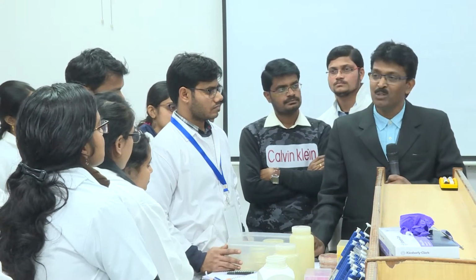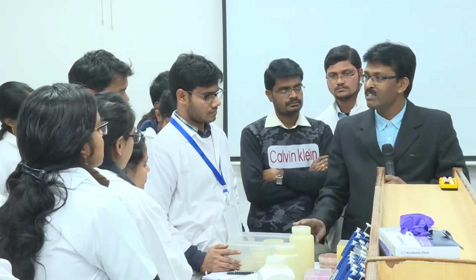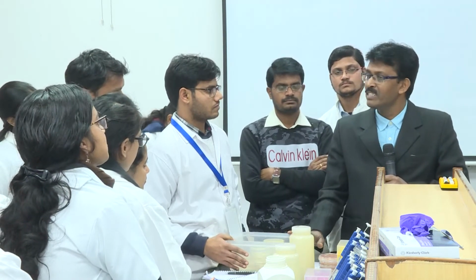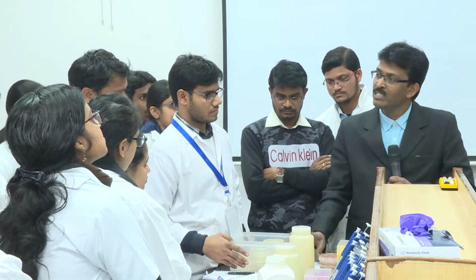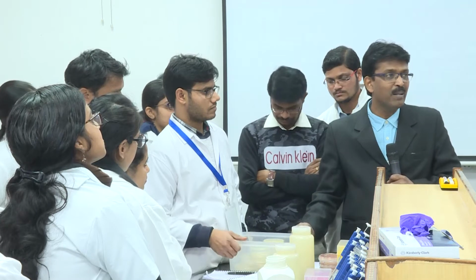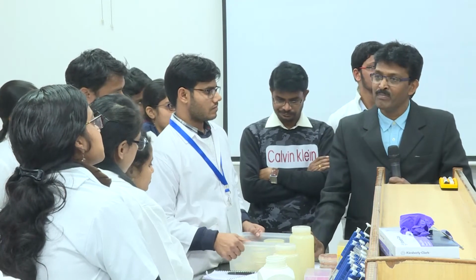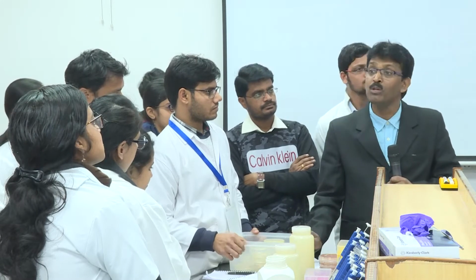So maybe after your classes, you come back in the evening, around 5:30 or 6 o'clock, and the media is already in the molten state in a setup. We have a kind of heat block, or sometimes we put it in the incubator at a high temperature, around 60 degrees Celsius. You pour it, then you go. The advantage is plates are available for your work for at least another 3-4 days. Every day you don't have to prepare this media in your lab.